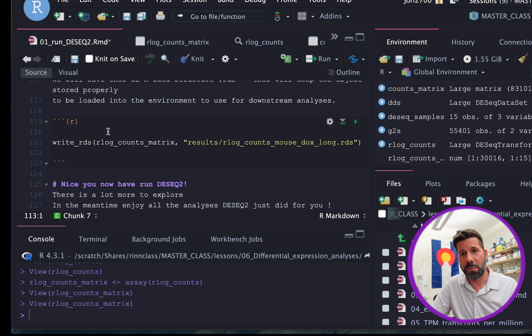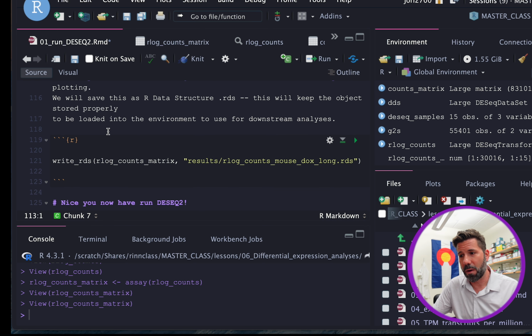Okay, that's it. We have now run DESeq, and all those result names are tables within tables within tables, and that's what's great about R and why it's better than Excel, is that you have all this metadata with data inside the metadata, and we're going to learn how to go in and dig that out and start finding out what happened in our RNAseq. But congratulations, you've now in just a few steps run the RNAseq pipeline to align the counts, and now DESeq2 to do differential expression.